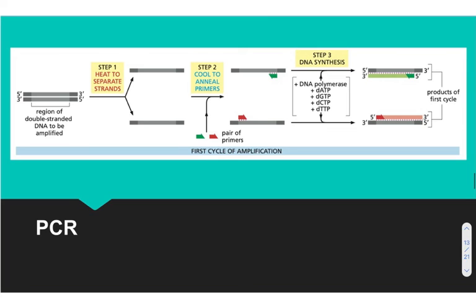And we can also look at PCR. PCR is polymerase chain reaction. This is our way of amplifying DNA into many, many copies over and over again, but without the use of a cell. In PCR, we're going to use heat to speed up the process of DNA replication. We make use of specific DNA polymerases from organisms that are what we call extremophiles, which means that they can live in crazy environments and still be okay.